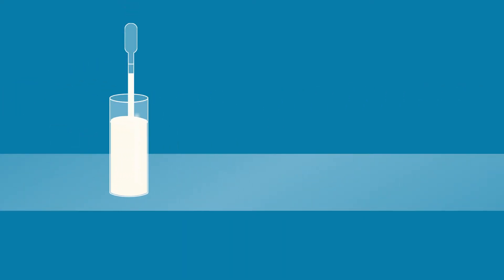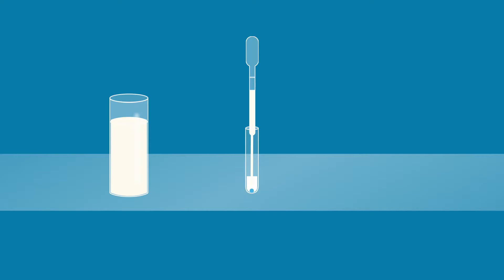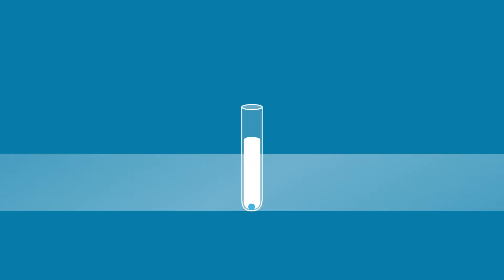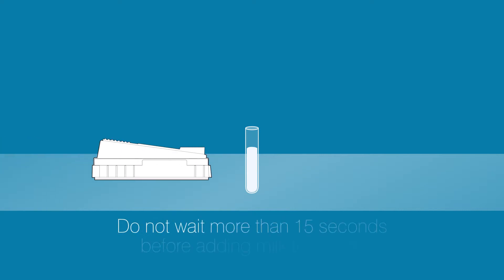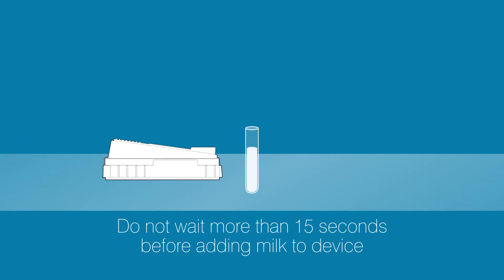Draw up the milk to the indicator line, and then add the milk sample to the sample tube. Shake gently to dissolve the pellet. Within 15 seconds, pour the contents into the SNAP device.